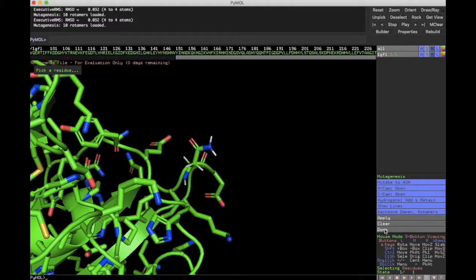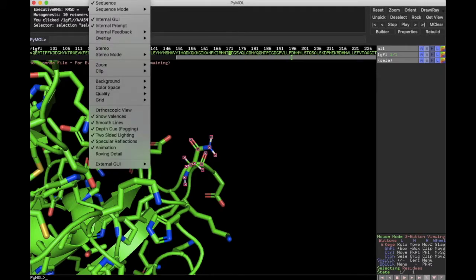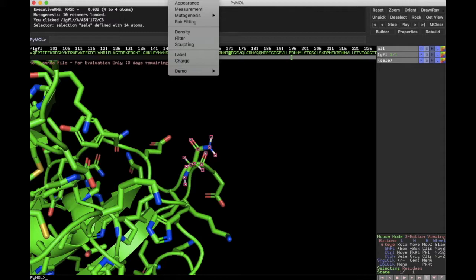And I'm going to click done here. All right, and so now that's a permanent part of the molecule here. Right, so if we click on it, we can see this used to be a glutamate. Now it's an asparagine. Right, and what we can now do is, if you go into Wizard again, you'll see there's something called sculpting. And sculpting basically means it's going to try and energy minimize the structure so that it mimics what it could actually be like in real life, right?